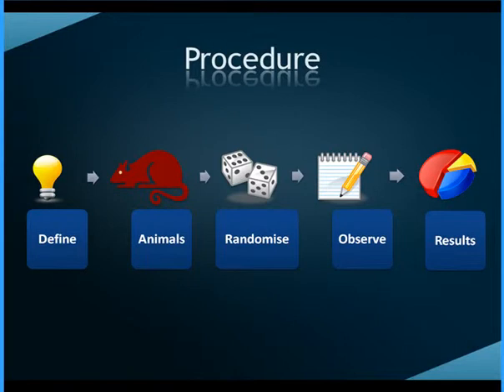To run the study, we will define the study parameters, the protocol, and also the treatment groups, and then we'll bring in a pool of animals and then randomly assign these animals to the treatment groups. We'll schedule a set of observations. These observations are captured over a long period of time, and eventually these results are analysed graphically.